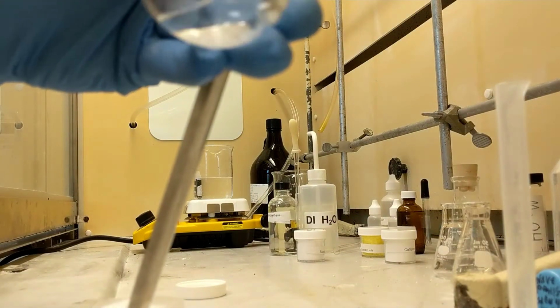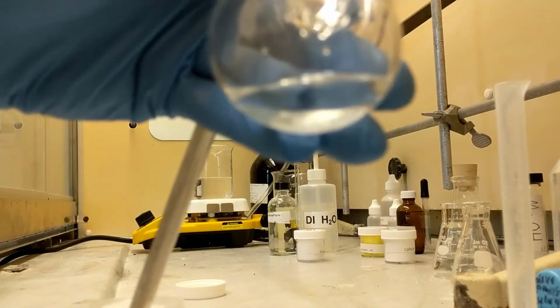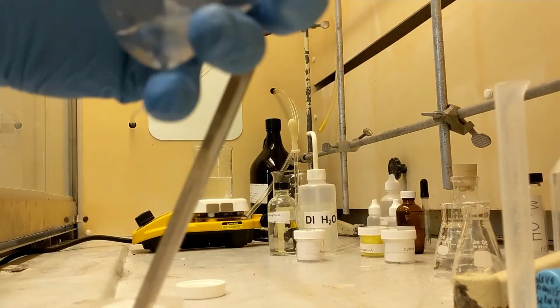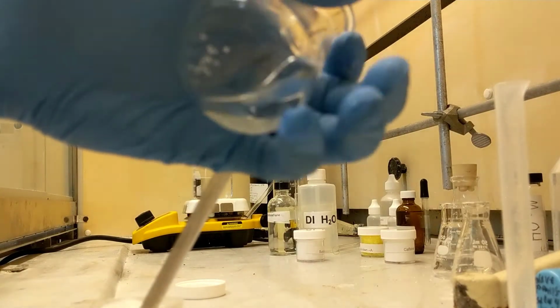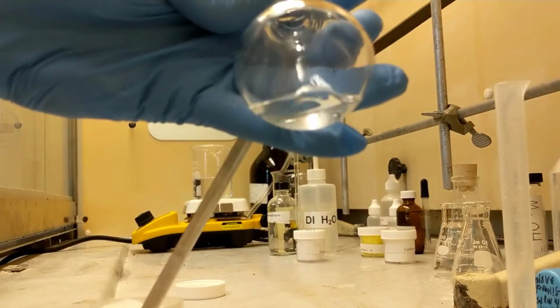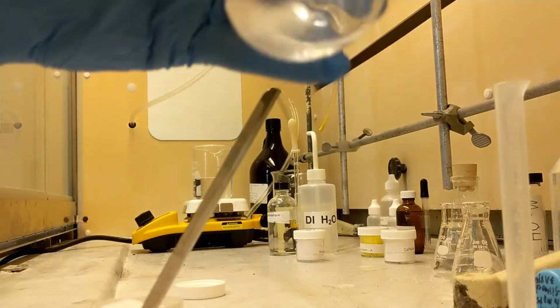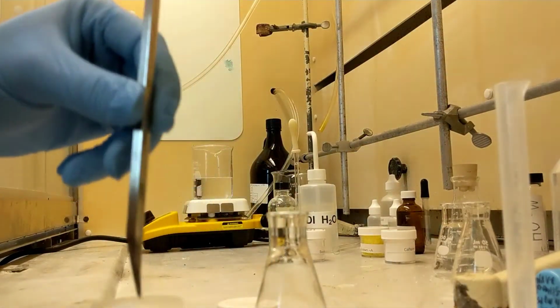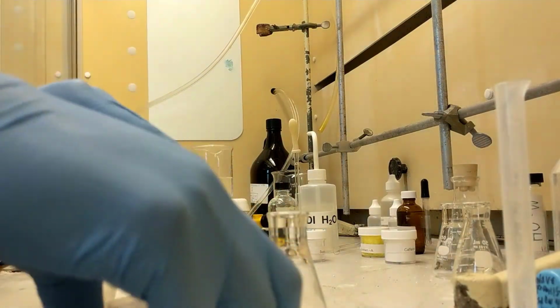If you look, yeah, look there, I really don't see any of it clumping. It looks all pretty free. Did you see? Yeah, it all looks pretty free. I think I'm good. So, now that that's done, let me close and seal everything.